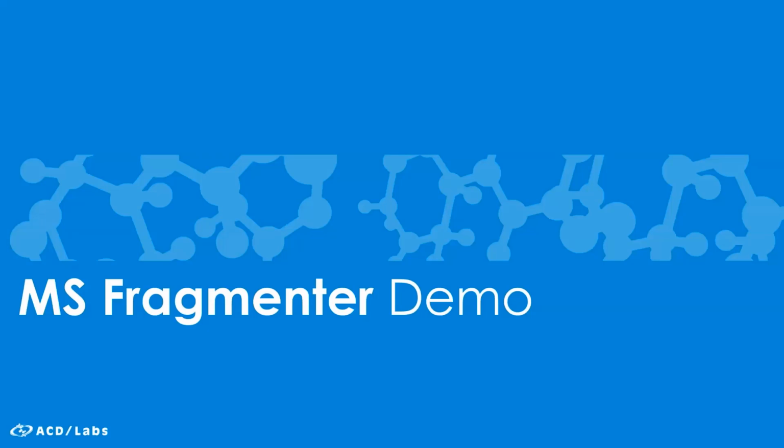Okay, so that's more or less it for the introduction. So I'm now going to move on to the demo of the software itself.